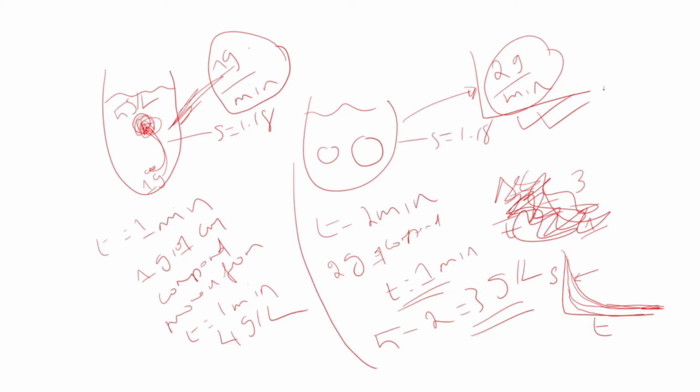So this will be with one particle, this will be with two particles, and that's because we are transferring more molecules from the solution side to the solid side when we have a higher seed loading.